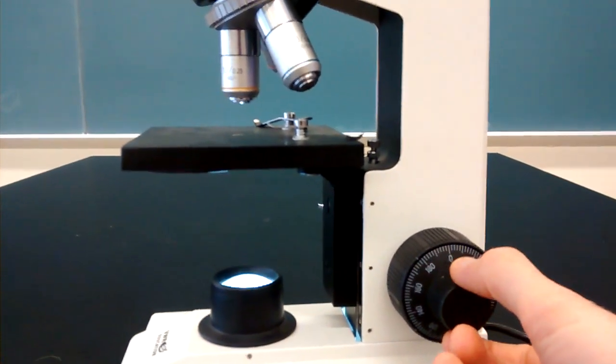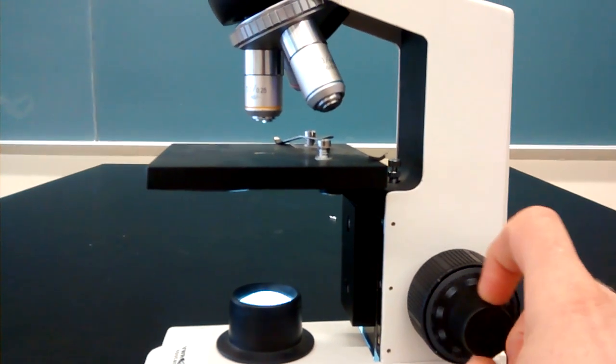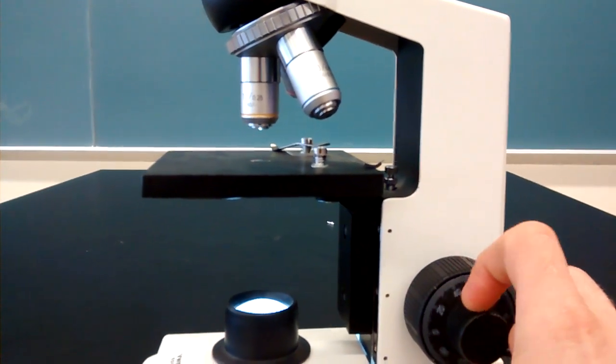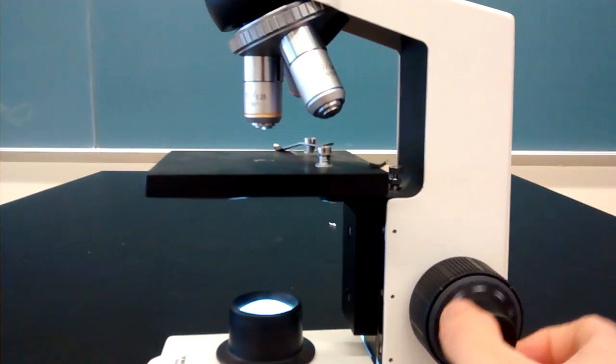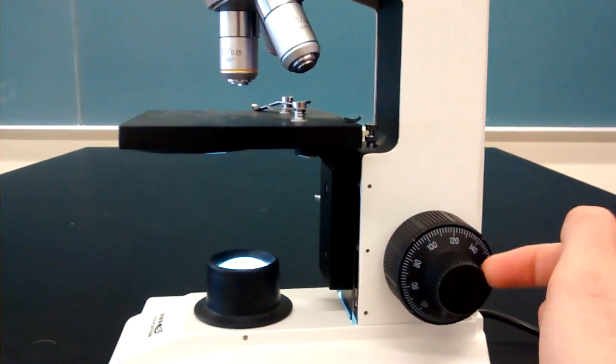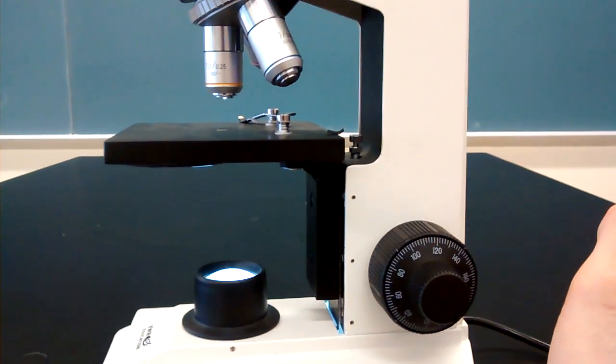Nested inside of that is this fine focus adjustment knob. That does the same thing the coarse does, but in much smaller increments. Sometimes the fine focus knob is a separate knob on some of the microscopes.